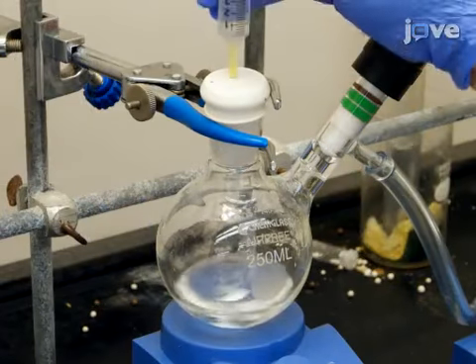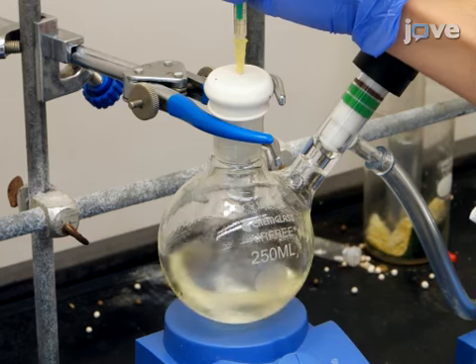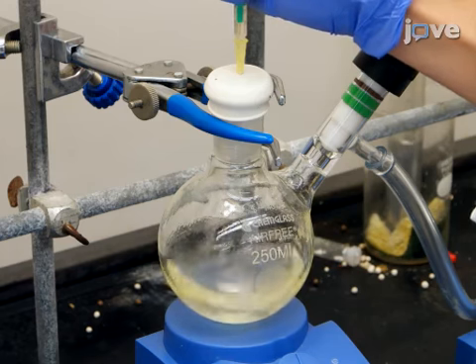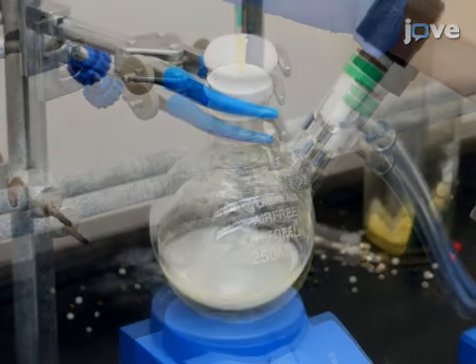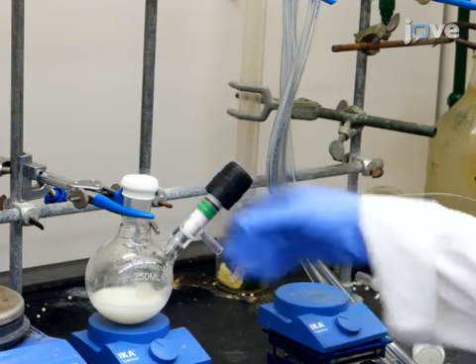Using a syringe, add 2.53 milliliters of dry degassed cyclohexene. Then, add 0.26 milliliters of phosphorus tribromide dropwise with vigorous stirring. The solution should immediately turn pale yellow with white precipitate forming after 20 minutes. Allow the reaction to stir overnight.